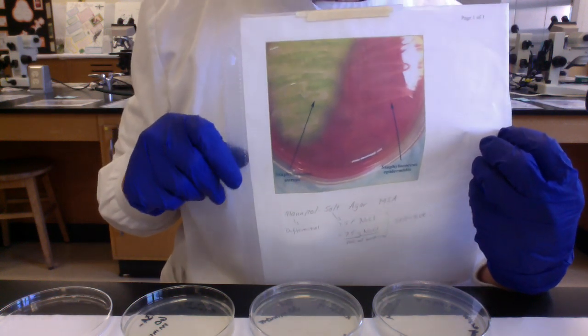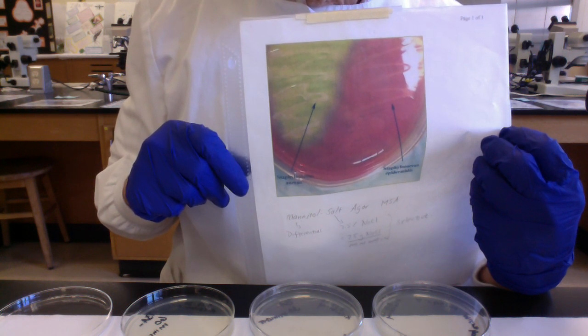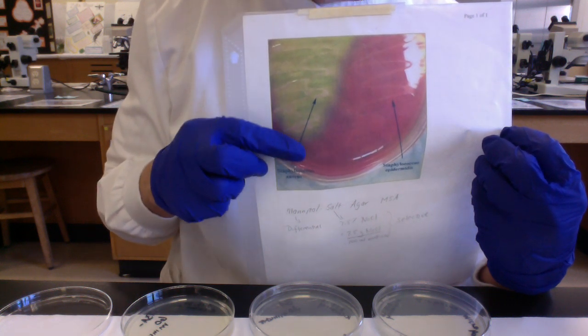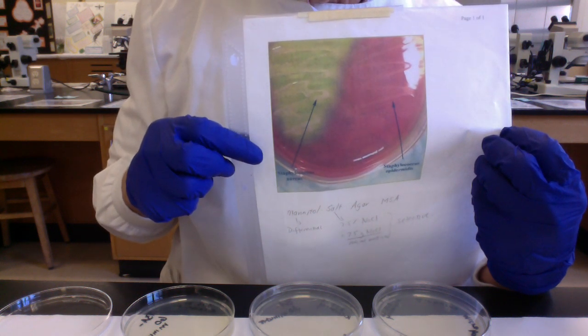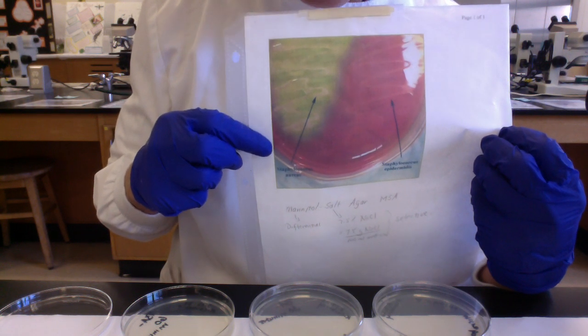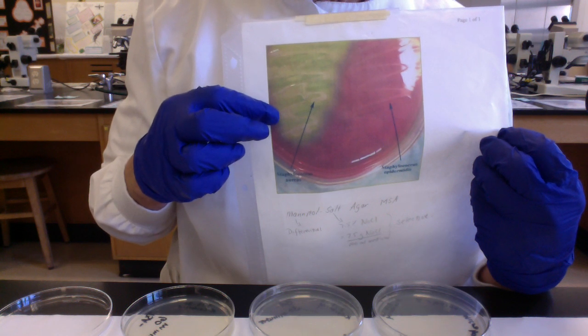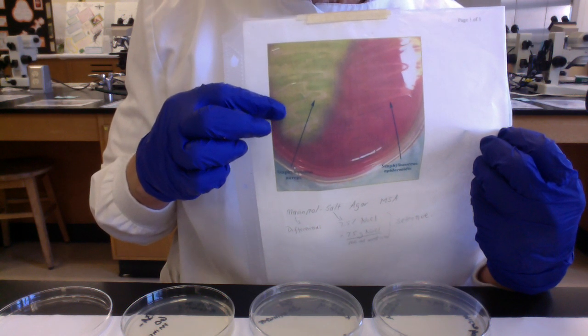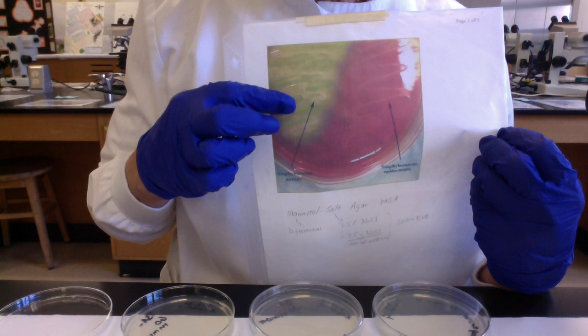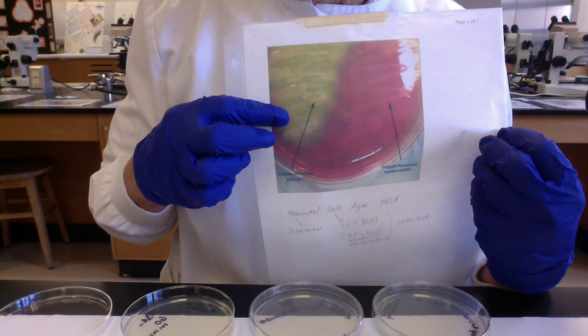Mannitol is a sugar alcohol. If the microbes can ferment it, they will make acids and the pH will drop. So what we do is include the pH indicator phenol red in the mannitol salt agar. At acidic pH, phenol red will turn yellow. So if the microbe can ferment mannitol, the pH drops and the phenol red will turn yellow. Yellow is a sign that the organism is mannitol positive.